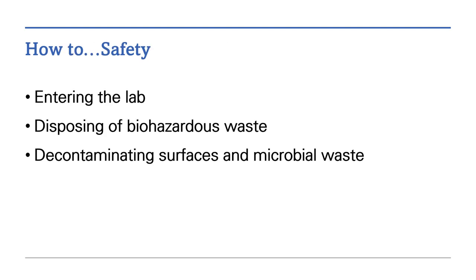How to Safety includes three videos. The first: entering the lab. The second: disposing of biohazardous waste. And lastly: decontaminating surfaces and microbial waste.